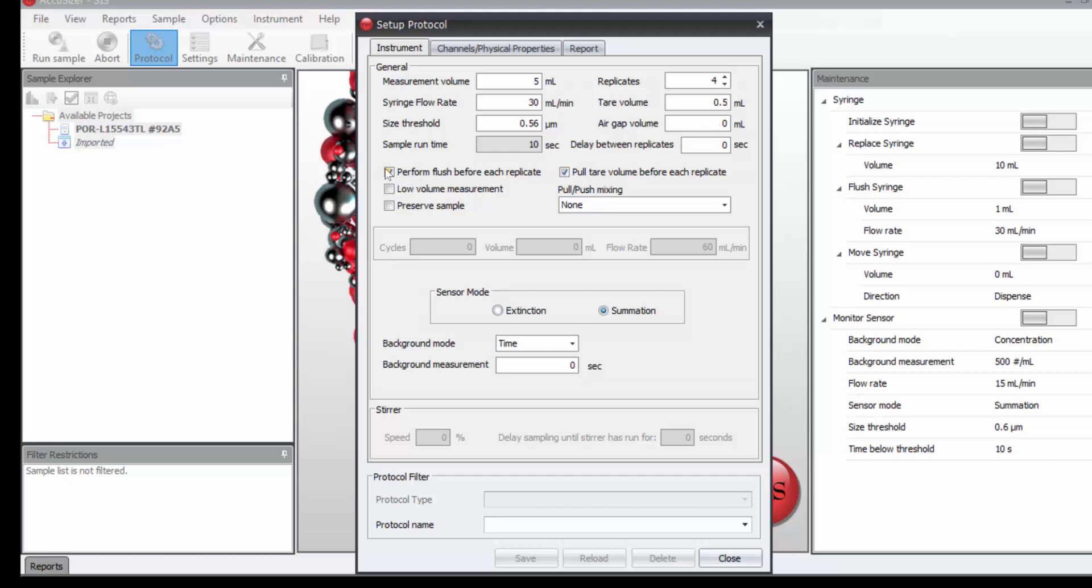We won't flush before each replicate. That's something we could do if we wanted to clean the system in between each run. I will pull the same tier volume before each replicate.